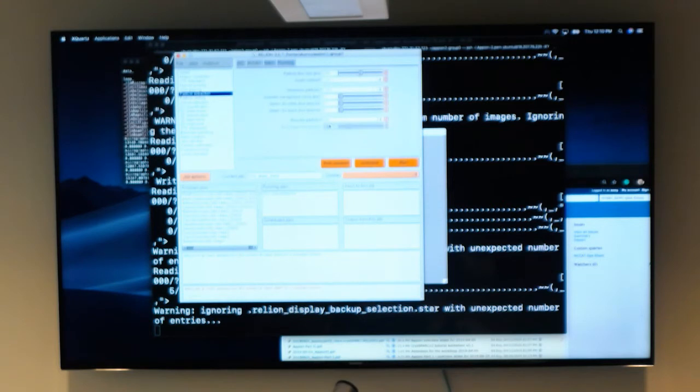They need different conformations. They need ligands. They need particular transitional states. In that particular person's field, it's not trivial, but it's very straightforward to get 6 3 angstrom maps from the same grid. So he was in a particular field where this becomes very important, because just because I get your 3 angstrom reconstruction doesn't mean it really helps you. It's actually quite disheartening when you're like, oh, I have 12 data sets, all of them go to sub 3, and none of them answer a scientific question that hasn't been answered already.